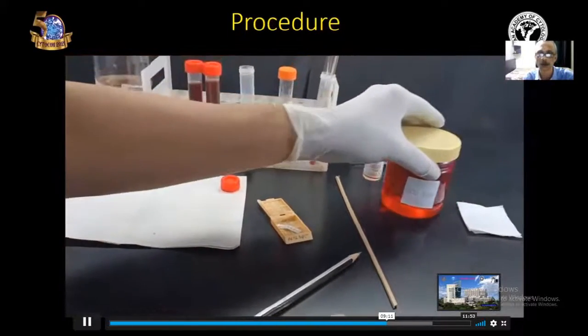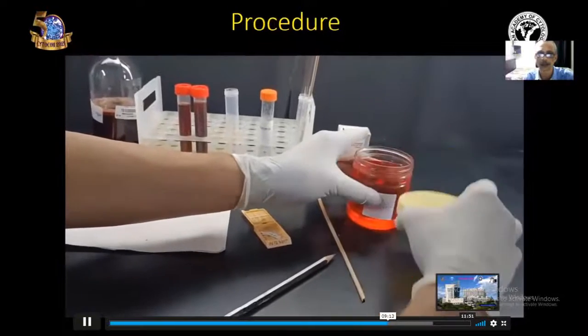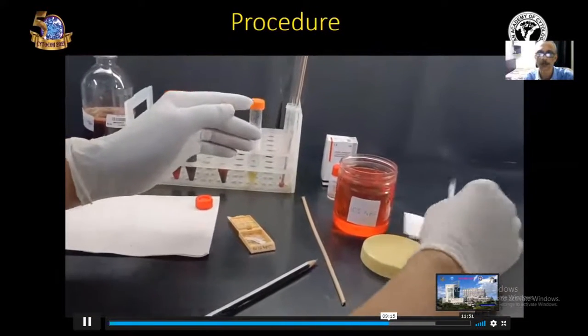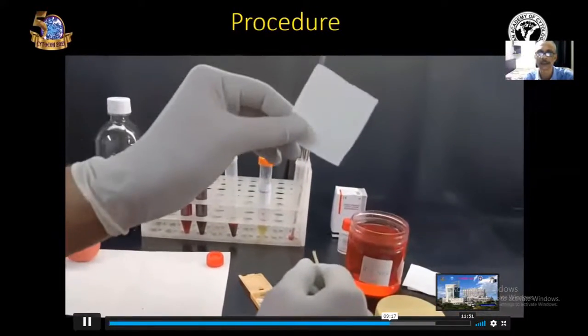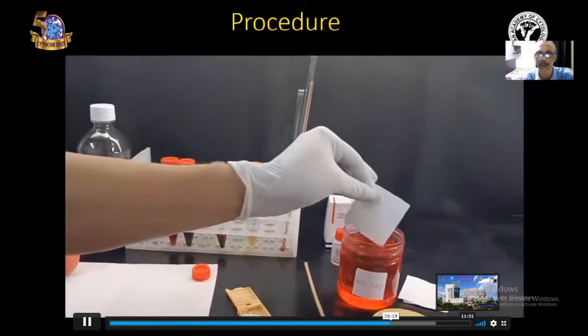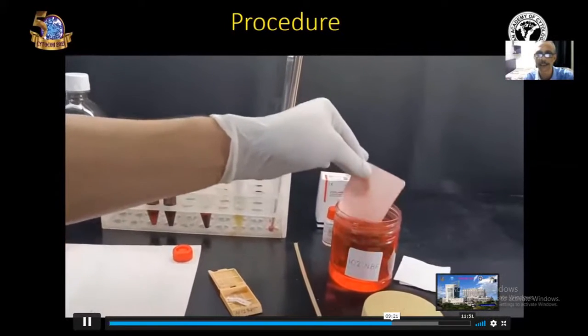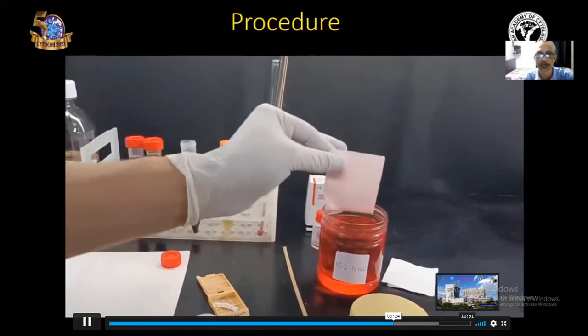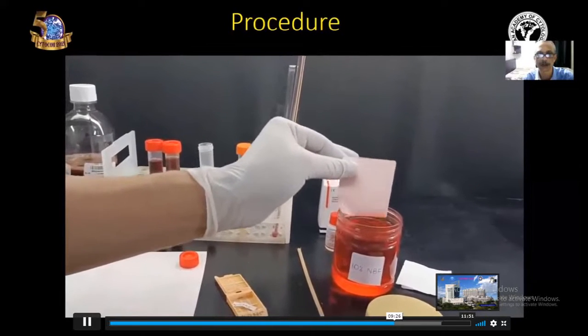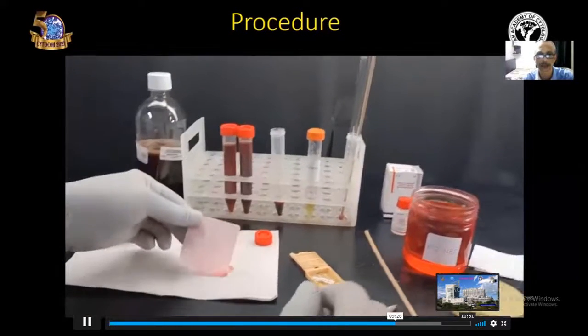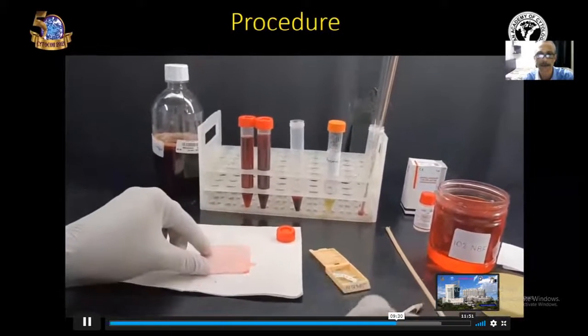Now, next step is open the fixative bottle and take a small Whatman number one filter paper which is cut in a small rectangular shape and dip it in the fixative. Now, the filter paper is flexible and we can keep the filter paper on a flat surface.